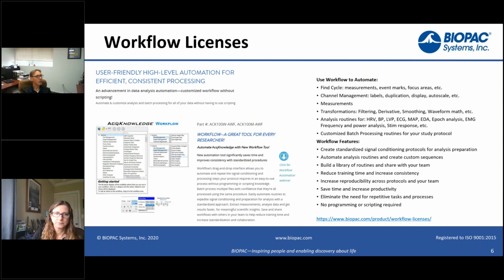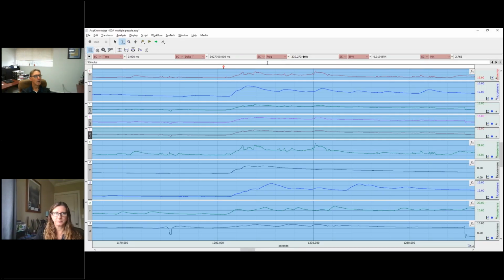So if you look, actually, Brenda, can you share my screen? Yes, I'll make you presenter again. Hang on one sec. There you go. Perfect, thank you. Hopefully it's stuck to the right. I see the graph. Perfect.